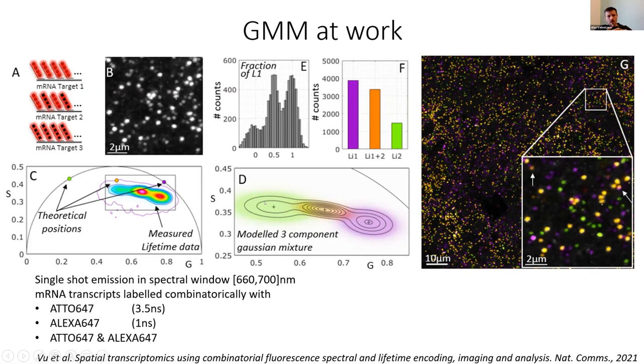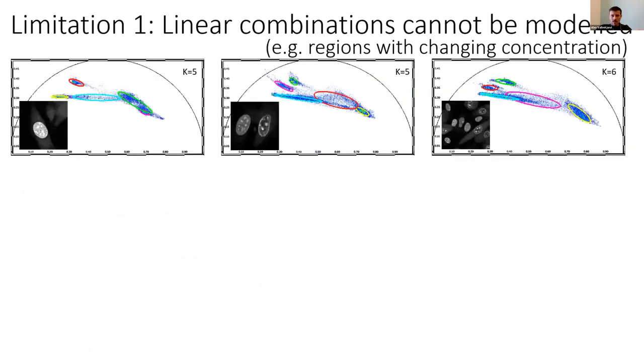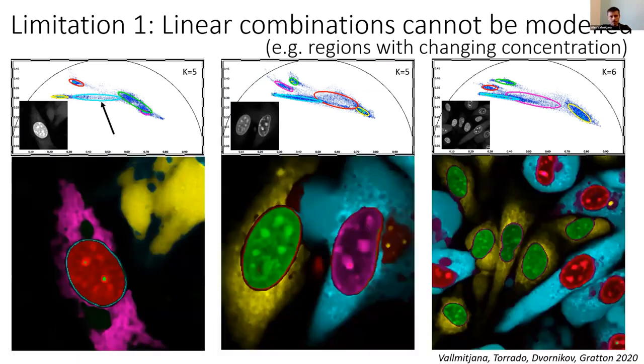If you do have an equal proportion of all the possible combinations in between, you cannot really model that with Gaussian mixtures. And unfortunately, it is a pretty common thing that you see. So here's a very complex case in which you have a bunch of distributions, and you see these streaks which correspond to exactly the transition between one component and the other. You have a bunch of pixels which have all the possible combinations between the 2. So if you try to model this data, you see this doesn't really make sense. This red cluster here, for example, is clearly wrong, or this blue one on the left. And the proof is that if you go to the original data, the blue one on the left side is basically not a real cluster. It's just trying to model a transition between 2 separate regions. The same applies to this one here or to that one there. So yeah, there are some limitations in this technique.